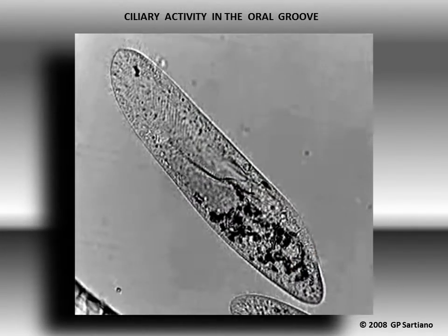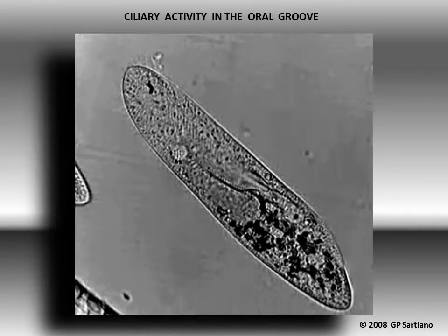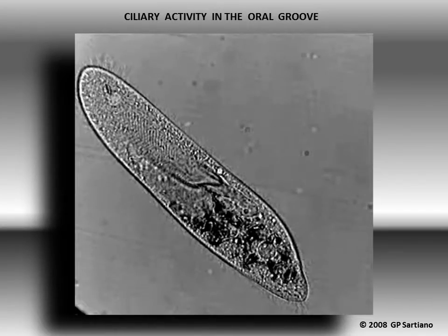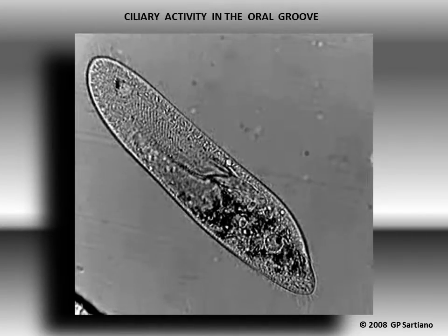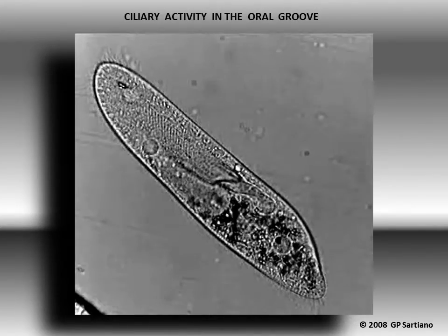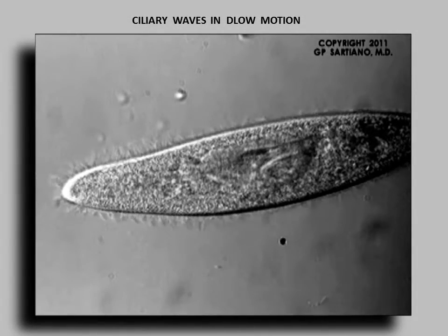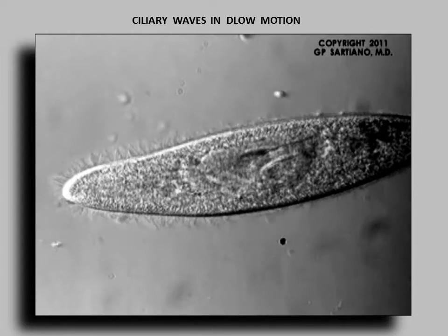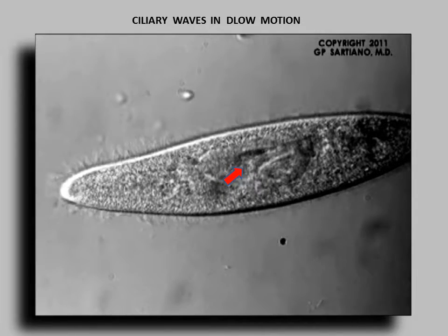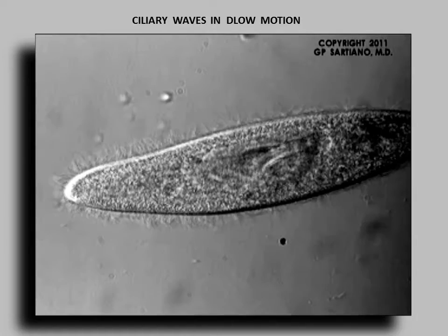This video illustrates the metachronous wave-like activity of cilia of the oral groove. And this slow motion ventral view shows how the wave-like activity of the cilia drives fluid and particles directly into the cytopharyngeal orifice.